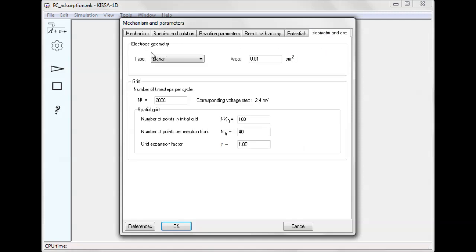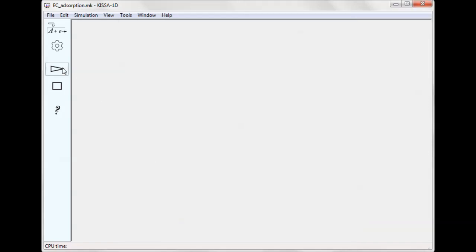Reactions are assumed to occur at a planar electrode with surface area of 1 square millimeter.